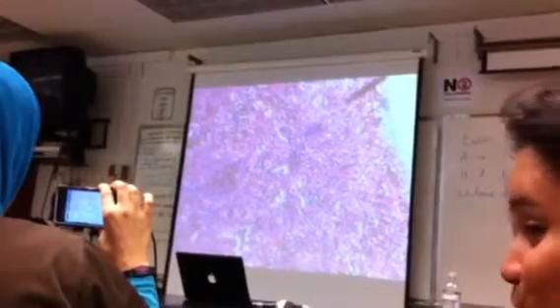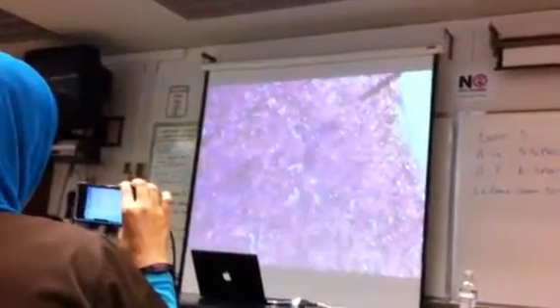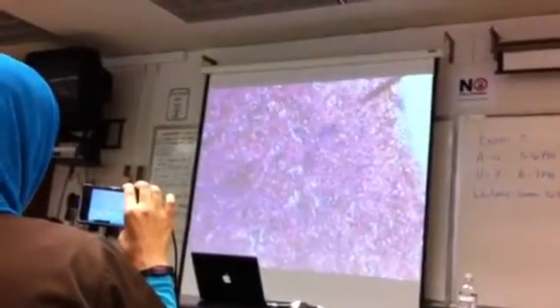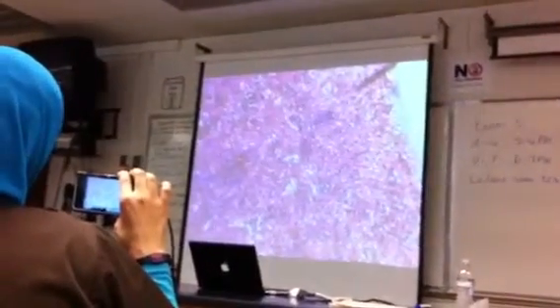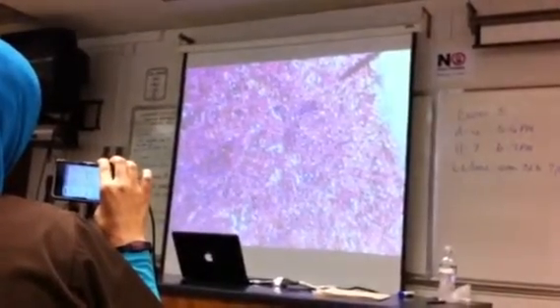Let me grab a couple of other slides out of here to see if I can get a better representation of the spleen. That's what happens when you buy new slides. It confuses the teacher. Okay, so let me substitute in this slide and see if it's any better.